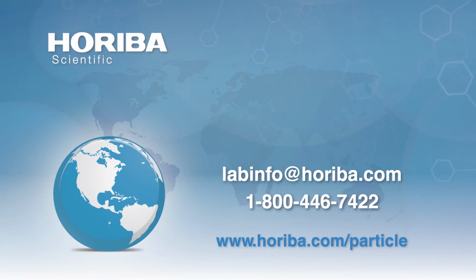Okay, we're kind of winding up here in terms of time, so if you have any last minute questions, I do have one. How do you calculate coating thickness? Okay, either Chris or I can handle that. It's simply just a subtraction method. So you're going to look at your initial particle size diameter in the fluidized bed, either inline or at line using CamSizer or a similar technology. And as you apply coating, you're simply looking at the particle diameter at time 0 versus particle diameter at some point during the coating process. And it's simply a subtraction method.